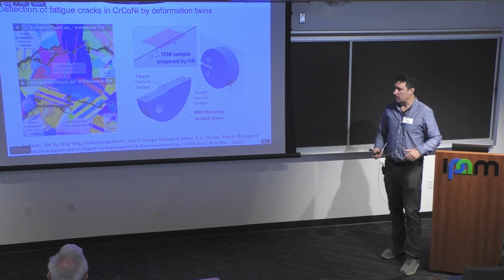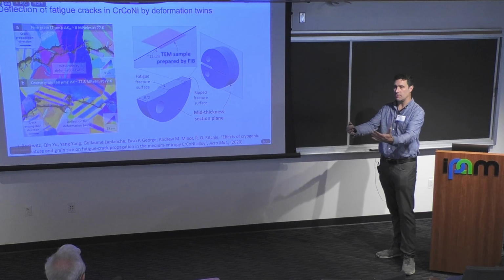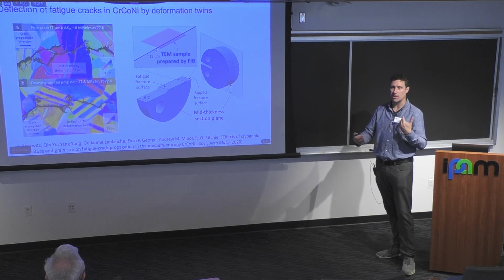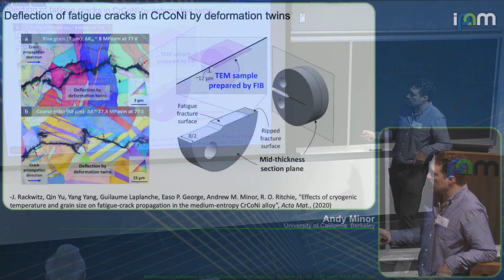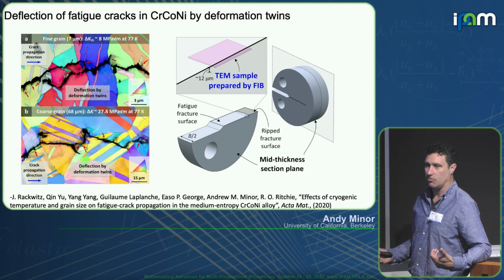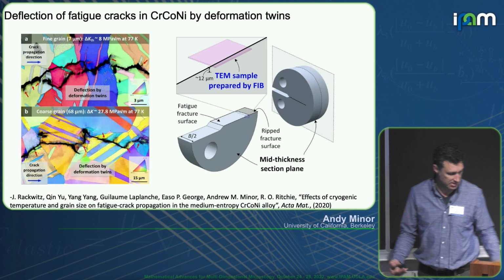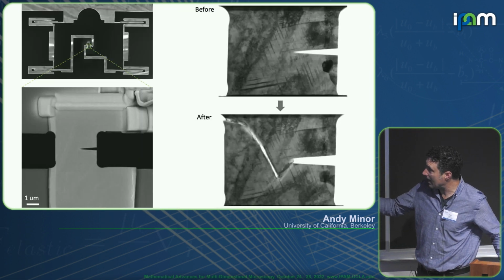And so we wanted to look at then, okay, let's say you put these structures into your material. How does this then affect your fracture toughness? Why are these barriers so good for fracture toughness? And so we did the same experiment, but now we took a foil, we took our sample from a region that's already been highly deformed, so a fatigue crack itself. We put it in the TEM, same thing. We put a crack in a sample that already had lots of twins in it.